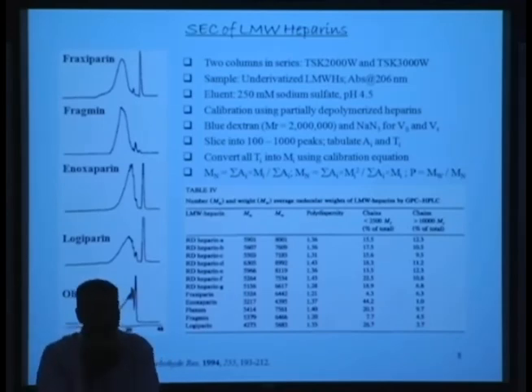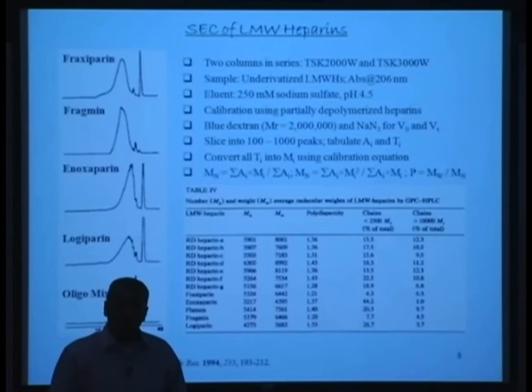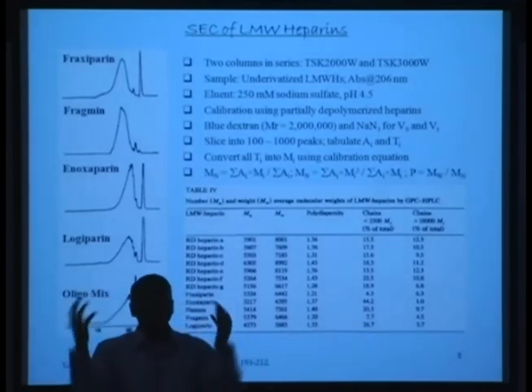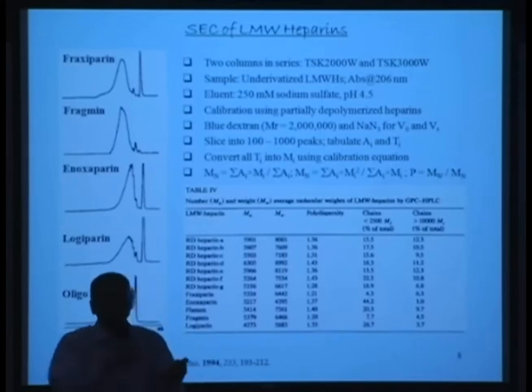Does that really represent the composition? It doesn't represent the composition. Okay? So what do we do? We take the proportion of this over the total and do a mass calculation so that we get a more accurate representation of the proportion of the average species.